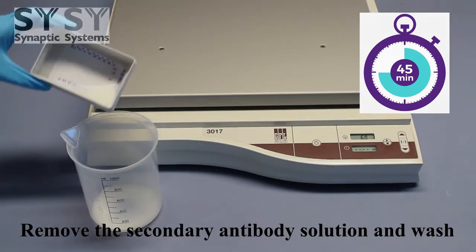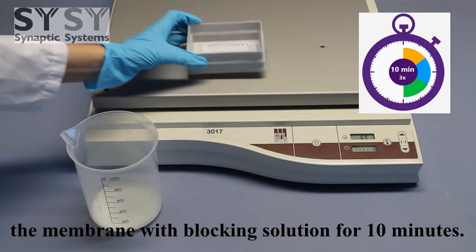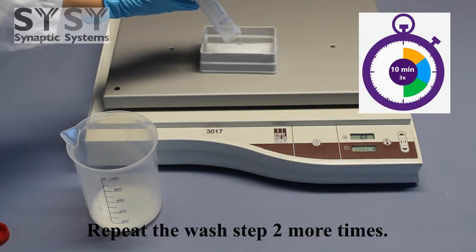Remove the secondary antibody solution and wash the membrane with blocking solution for 10 minutes. Repeat the wash step 2 more times.